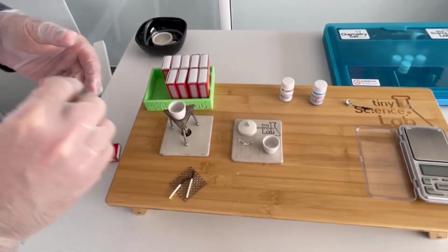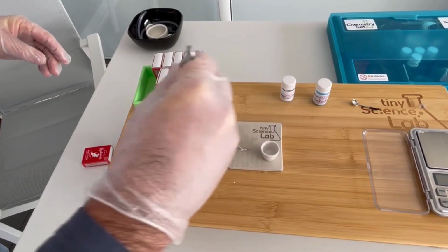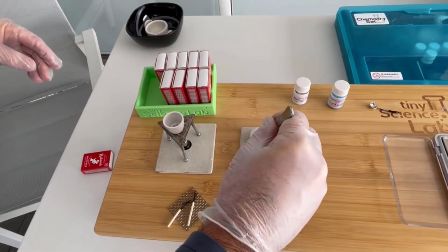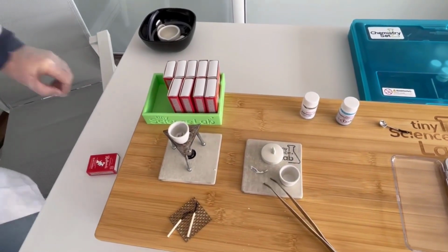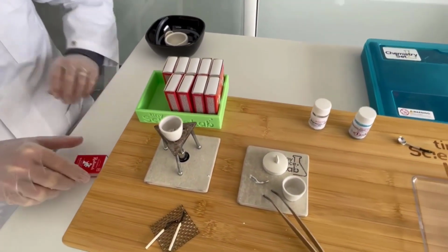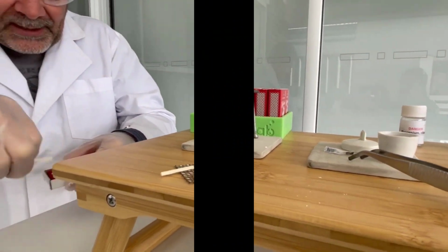And I have my crucible lid, which I can place on there to ensure that none of the smoke escapes. But what I want to do first is start to heat it up. So let's turn this Bunsen burner back on and heat it up.